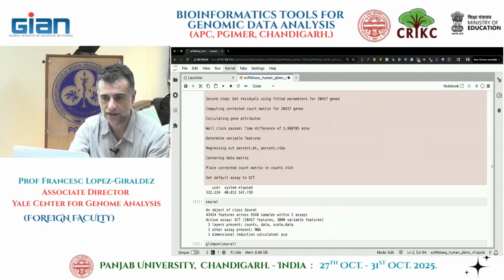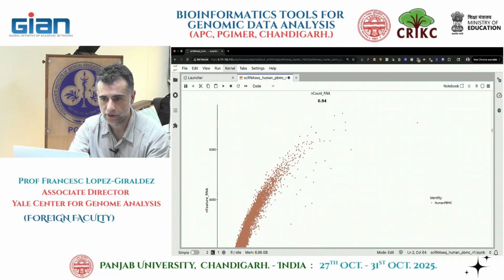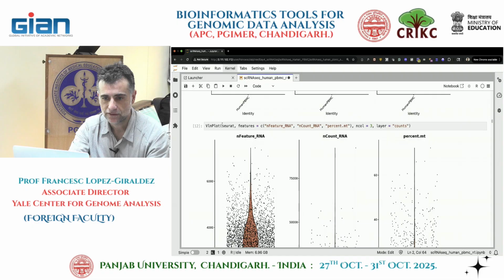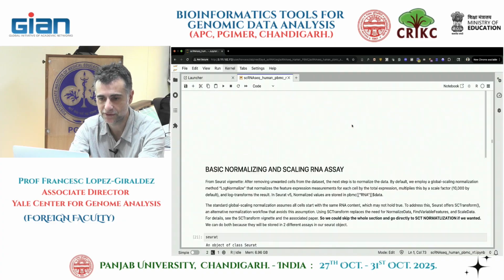And what I'm asking is to use a violin plot, which is the one we used all the way up. Yeah, a violin plot, right? So if you don't want to type everything, it doesn't matter. Okay, I don't need to copy anything actually.